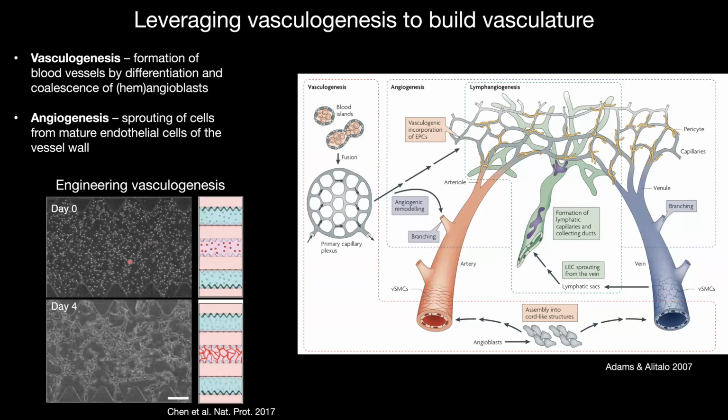Here, this is a slightly different device structure. It's one in which there is not a needle running through the hydrogel. It is just a central channel that contains individual HUVECs embedded within fibrin. We can allow the fibrin to polymerize, and if we give them the right cues, sometimes fibroblasts are necessary, these cells will self-assemble into something that looks a bit like a vascular network, using some signaling pathways that are upregulated during developmental vasculogenesis. So this is sometimes called a vasculogenesis assay.